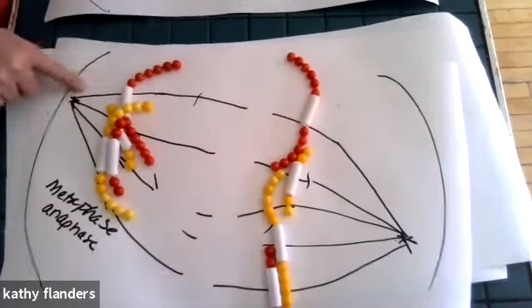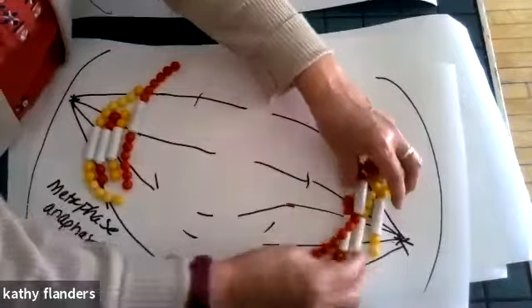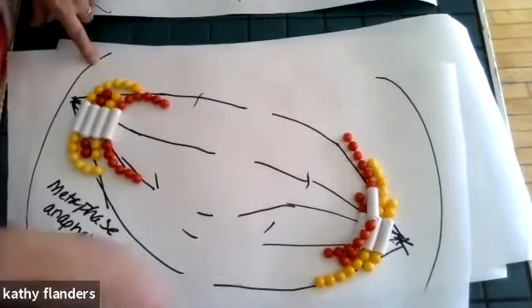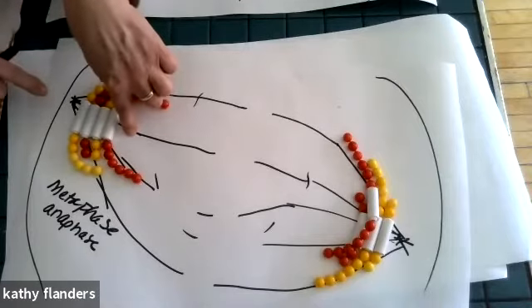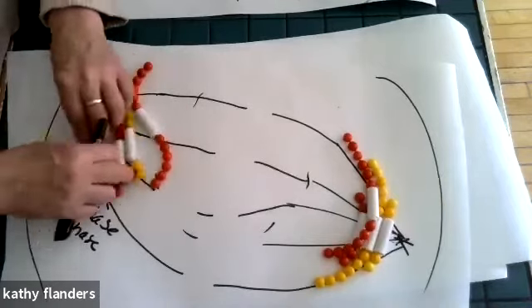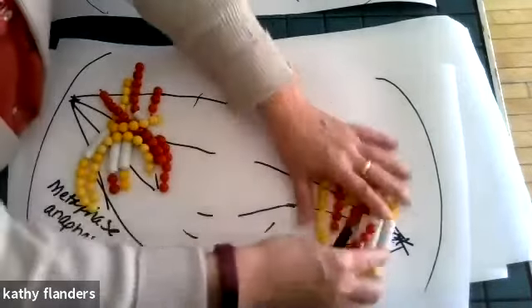This actually is now called a centrosome, but don't worry about that. So all of these are going to pull up into the top of this spindle. And remember, this is our whole cell now. So once they get up near the top, all of these are going to decondense again.